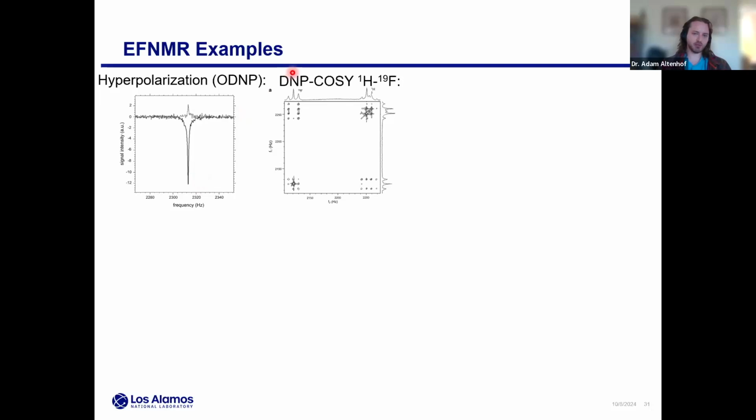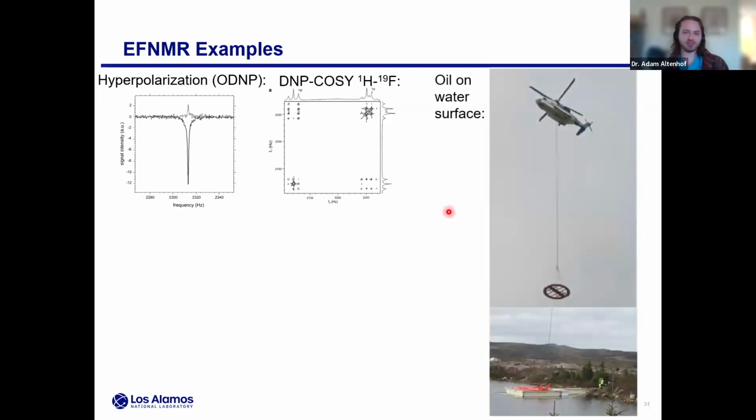Once they had their spins hyperpolarized, they actually did multi-nuclear 2D NMR. Because we get the proton and the fluorine in a single acquisition, if you just run 2D COSY, it's pretty crazy because you get these four 2D spectra, right? The homonuclear and the heteronuclear correlation. So really interesting stuff here. This is a sort of classic case. This is always fun to see and to describe.